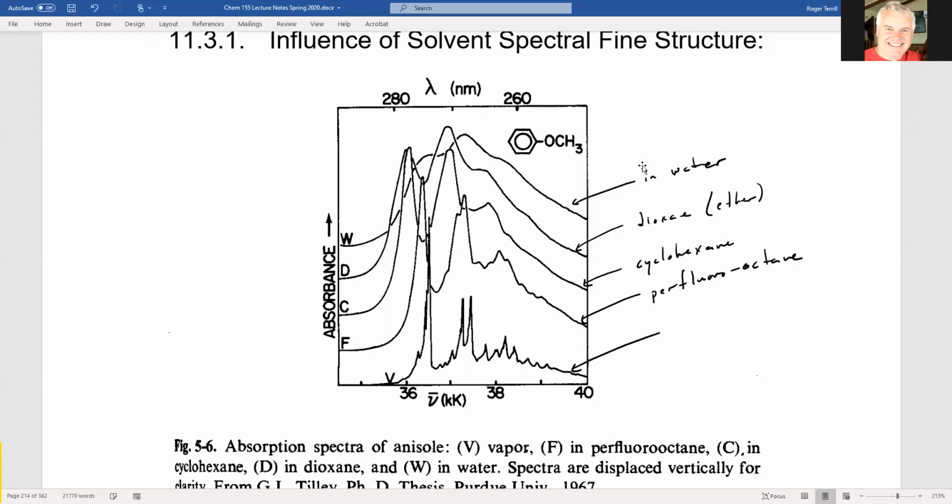And this is in the vapor phase, the gas phase, right? So you can see how, let's look at these two bands as an example. First of all, even in the vapor phase, what we see are ensembles of rotational, vibrational, and electronic spectrum. So there is spectral broadening contributing to this fairly well-resolved spectrum, right?